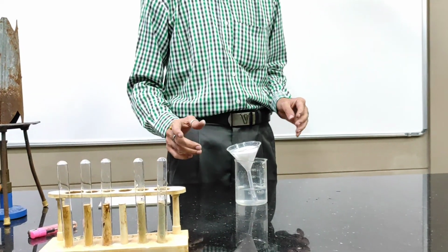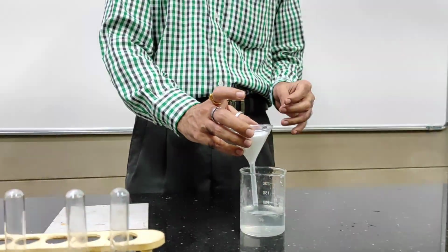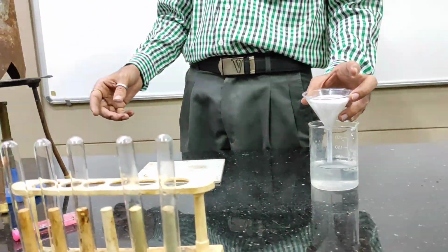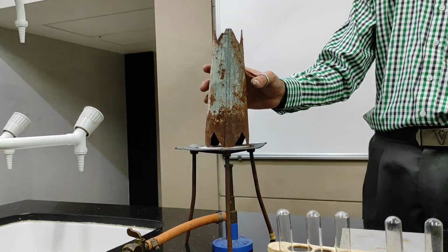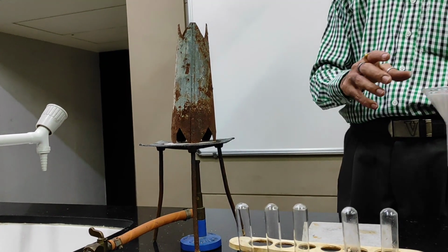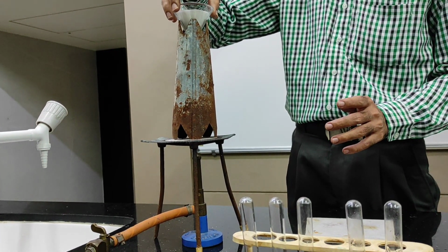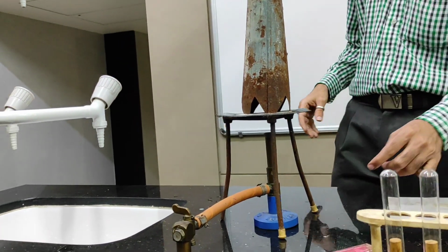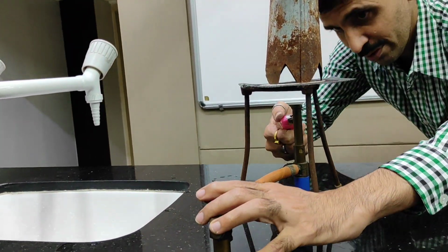We are almost coming towards the end of the experiment, my dear friends, and that is, we are now going to dry this on a cone. So have a look at this particular assembly. We have a wire gauze which is going to be put up on the tripod stand, and this is the cone which I am referring to. So I will be putting this filter paper along with the funnel on this cone, and we'll start with the burner.